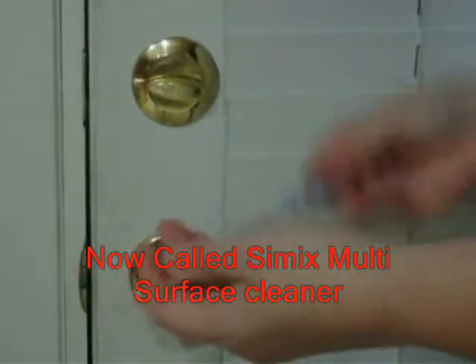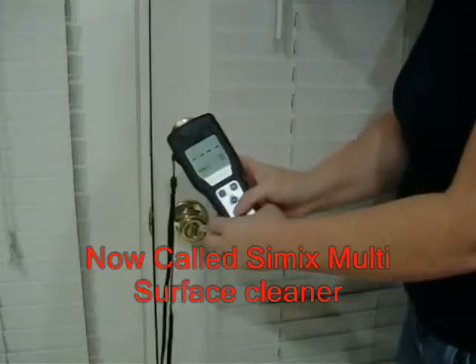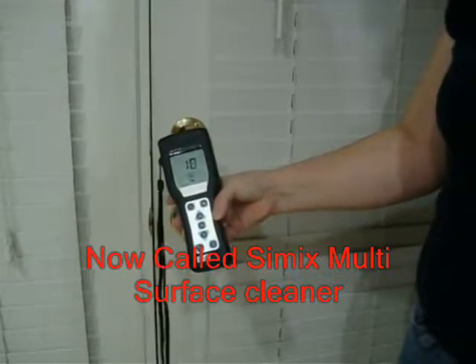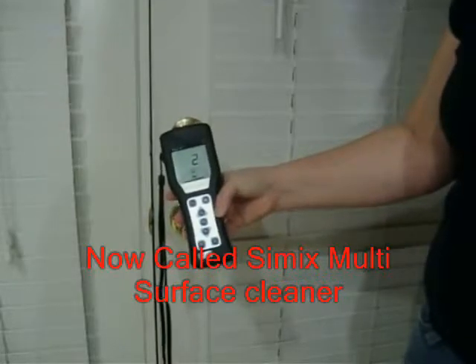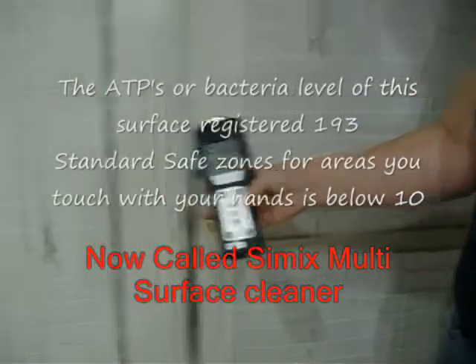ATP is a biochemical presence in all living organisms. If ATP is detected on a clean surface, it means the cleaning was not effective and the surface is a hazard for the spread of microorganisms. The ATP method is quick, simple, easy to do, and objective. The results are given in RLU, relative light units, and interpreted automatically by the testing equipment.